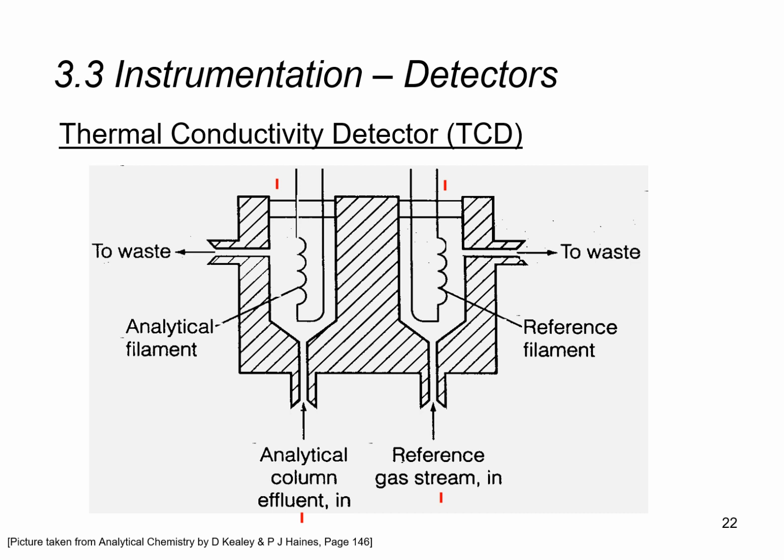Its temperature will change because heat is being conducted now by ethanol molecules, no longer by nitrogen molecules. As the temperature of this filament changes, we'll observe that the resistance of this filament varies with temperature. When its resistance changes, the current passing through this wire also changes. That is how this detector detects a change and tells us that yes, there is a strange chemical component now passing through the detector, right? It's not purely the carrier gas, which is nitrogen.